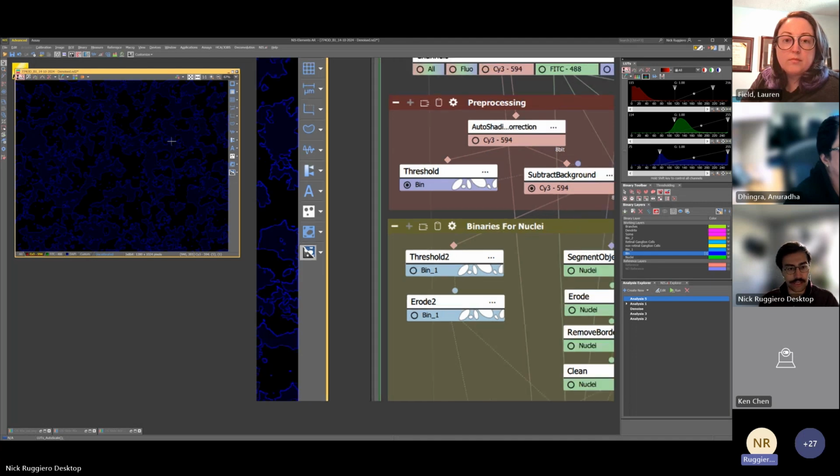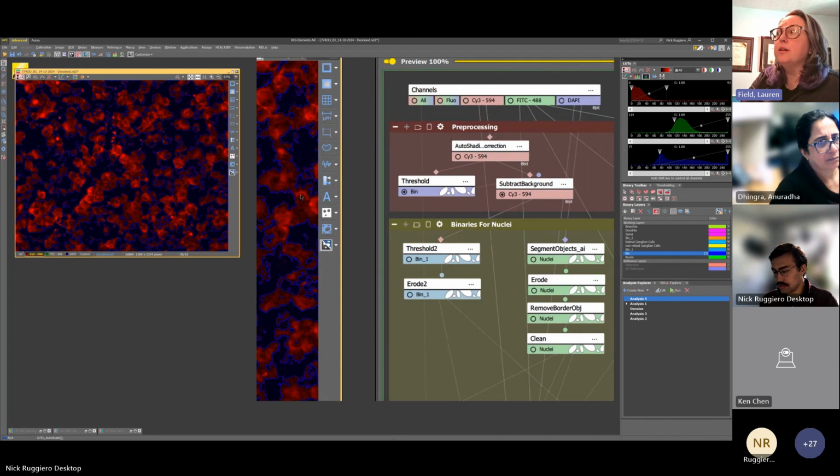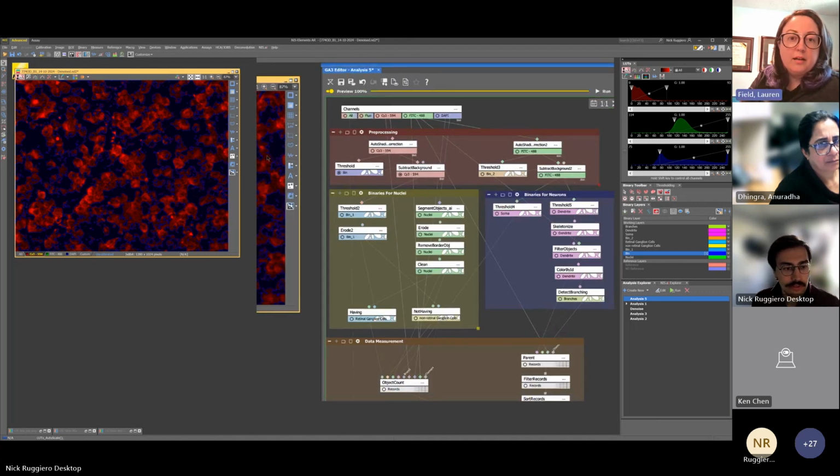that, let me zoom out again. Nick, I would zoom out. You're rendering a little weird in the share. Oh, okay. There you go. Yeah. All right, that's better. Yeah, sorry. Let me know if you can't see something. We're trying to, we know it's like things are small, and so I'm trying to zoom in so that we can see what we're doing.